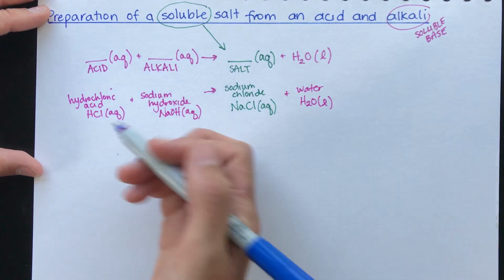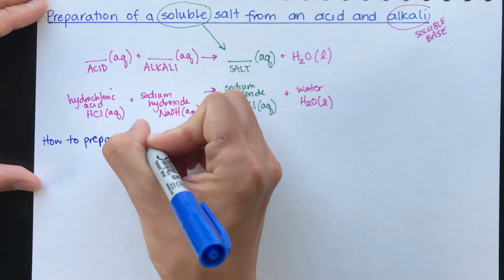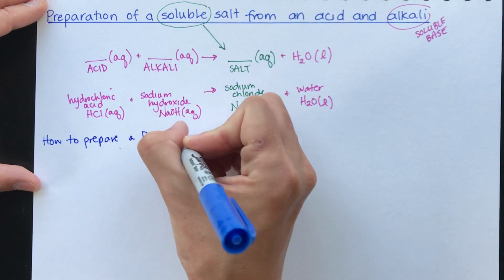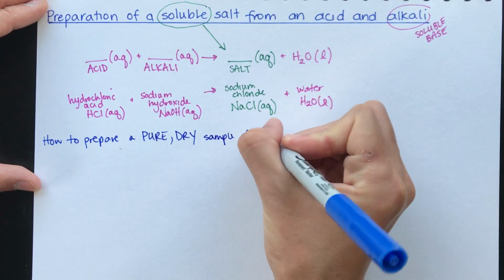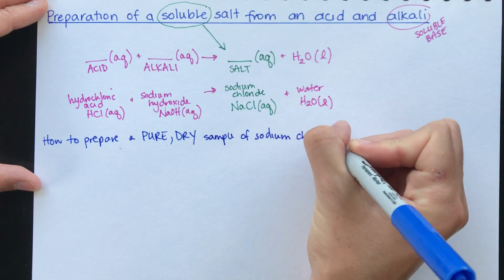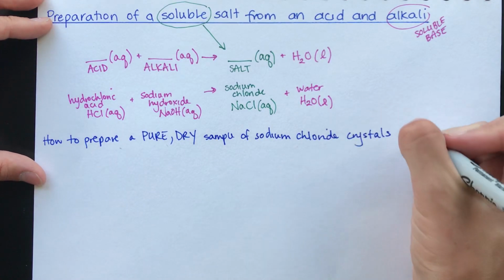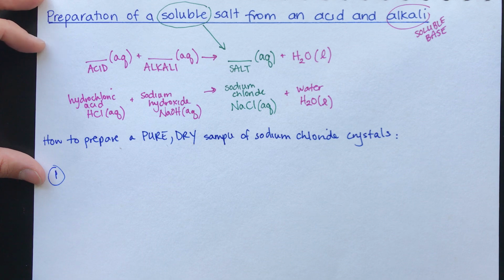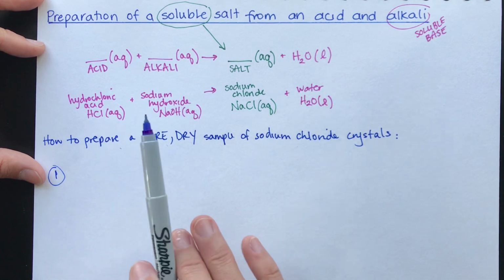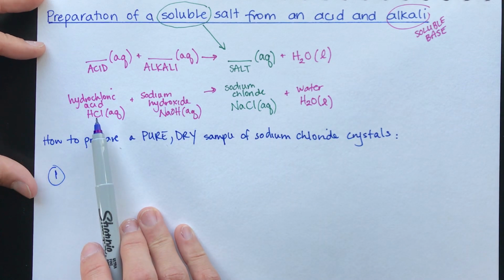So we can jump right into the method for how to prepare a pure dry sample of sodium chloride crystals. All right, so step one. We need to mix our acid and alkali, just like we've done in all the previous methods. But we need a more accurate tool because we need to measure exactly how much alkali it takes to perfectly neutralize the acid so that we have no leftover reactants.